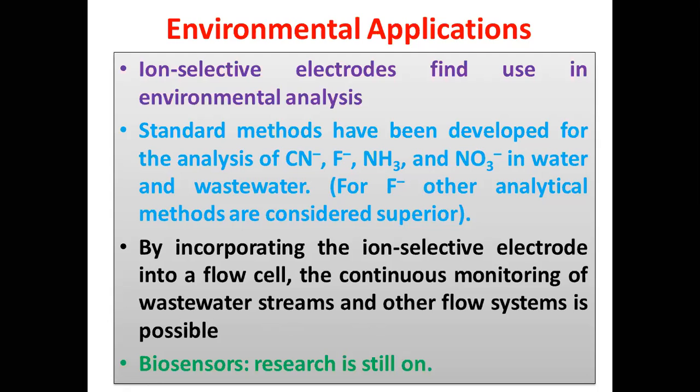If you look at the articles published in the field of biosensors, a huge amount of work has been devoted because of the principle of the potentiometric technique. Whatever it is, either chemosensor or biosensor or ion selective electrode or solid state crystalline membrane electrodes or liquid based ion selective electrodes, the principle behind the functioning of each and every sensor remains the same. There must be a relationship existing between the concentration of the analyte and the EMF of the cell, and the electrode calibration must be known to the worker. Then only there will be a fruitful outcome. Therefore, the research is still on in developing the biosensors.